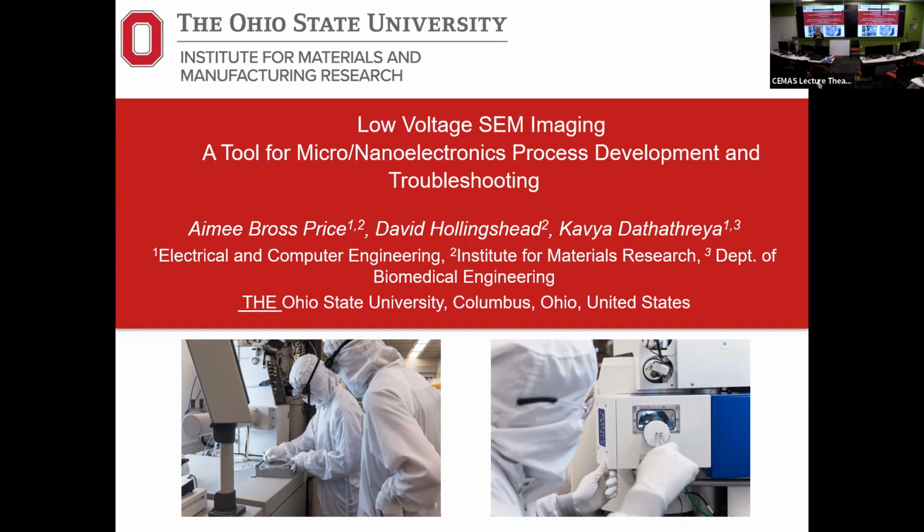So we are basically fabrication scientists and engineers that are using microscopy as a tool to evaluate our processes and our devices, rather than microscopists that are using tools to advance the field of microscopy. So my talk today will be focused on that, basically on the applications for electron microscopy in a nanofab or a fabrication environment, more on the research side of things than on a production side, but we can talk about that a little bit. So I'll go through a lot of applications about why we use electron microscopy and specifically why we use low KV SEM.